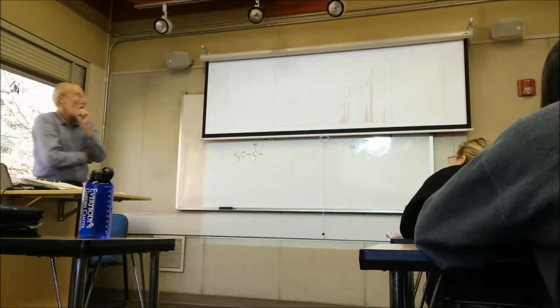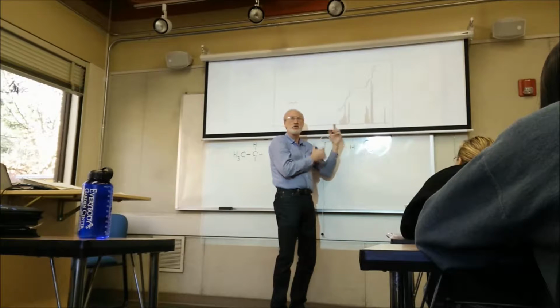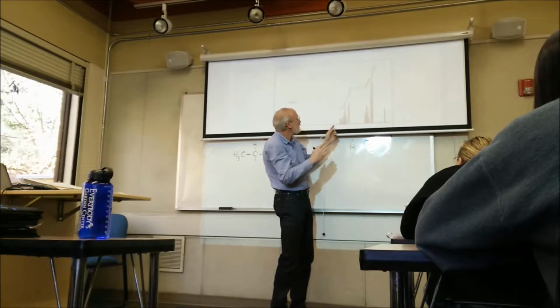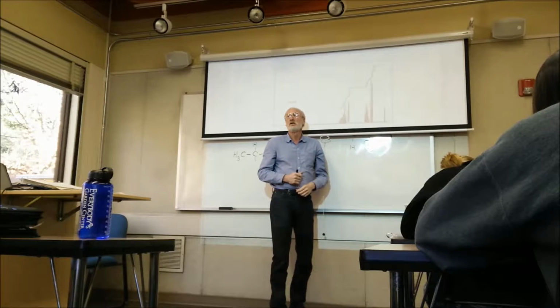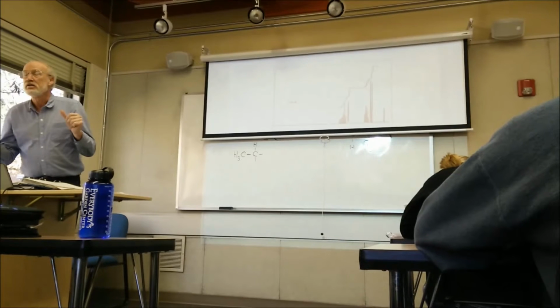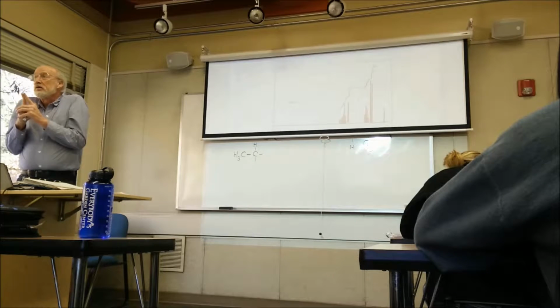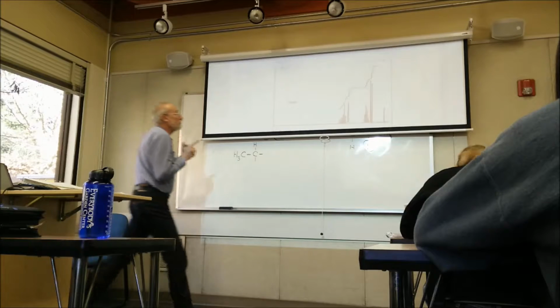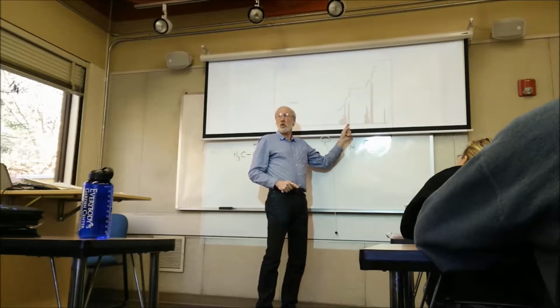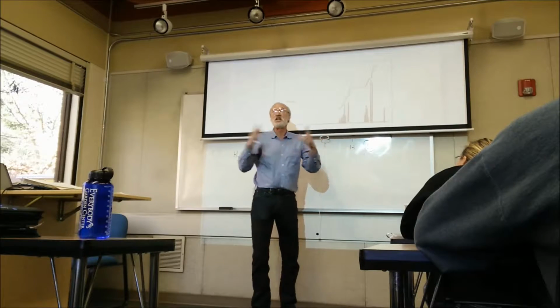The thing that tells you it's an alcohol is this resonance right here. It's about where an OH proton goes, and you see how broad it is at the bottom compared to all the other peaks? There's no splitting there. Well, yeah, and also I think, or maybe I'm misremembering, that it doesn't have the clean line that kind of comes down. Yeah, it's not split. Right. It's not split, but that's normal for an alcohol. So what we're going to assume is this is an alcohol, and there's decoupling going on.